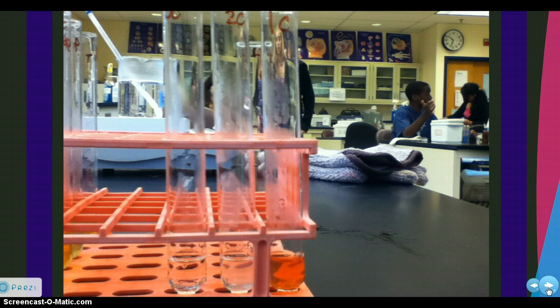These test tubes were placed into 37 degrees Celsius water and left there for 10 minutes to heat up the enzyme. When they were pulled out, we added catechol to them, and we waited to see if there were any visual reactions. I apologize, I just told you a lie.